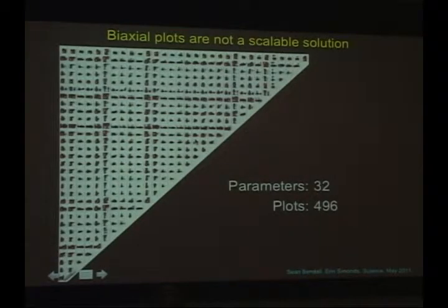But let's say you do a CyTOF experiment with 32 parameters, and the panel I'm currently designing has 39, so this only gets worse. You can get a pretty staggering number of biaxial plots. So obviously, this is not an easy way to look at your data as a whole. And that's what necessitated the development of SPADE.